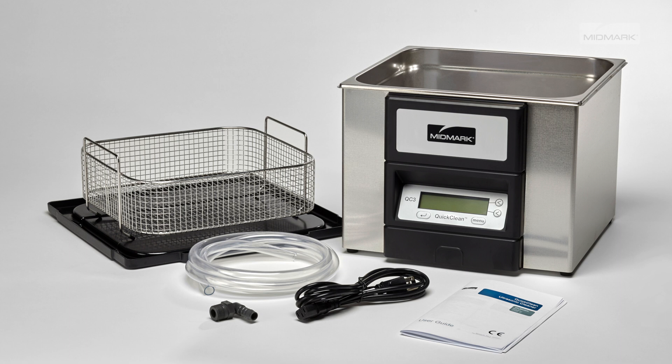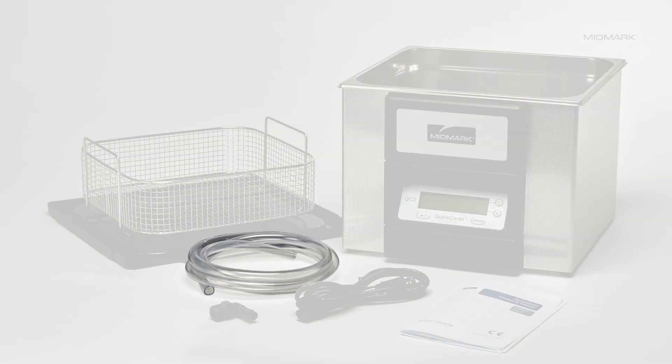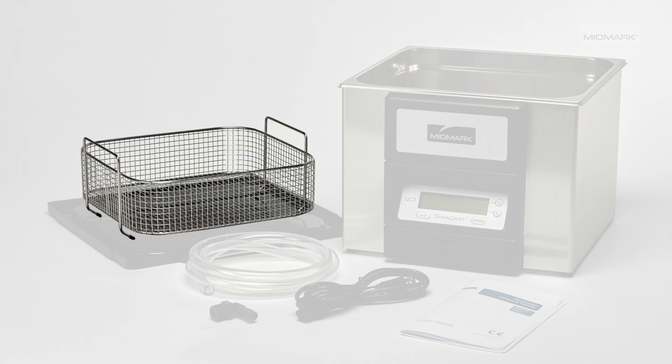The contents of your ultrasonic includes the QuickClean unit, user guide, drain hose, hose connector, power cable, safety basket, and lid.